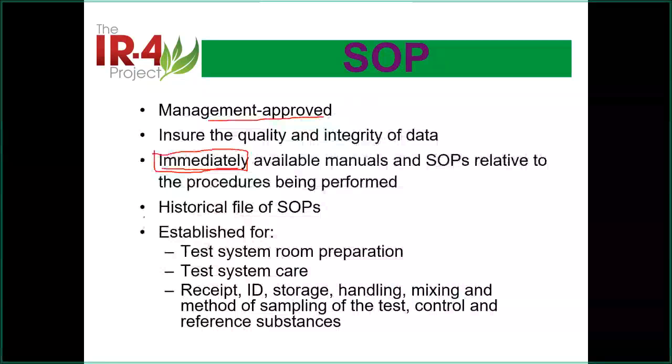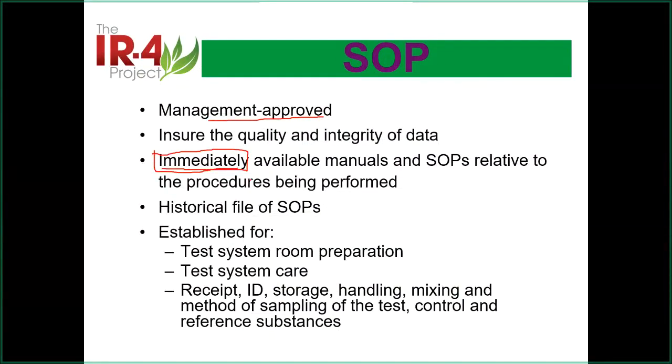Yes, it's here. You bring it, immediately you find it. So that's immediately available. Of course, then the following question is how you control the SOP. I'm not going to say you just print any copy, loose copies there, but you need to have another measure to control how many copies there are and how you do that.